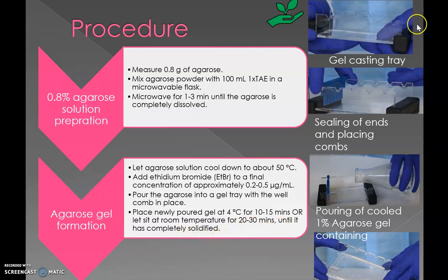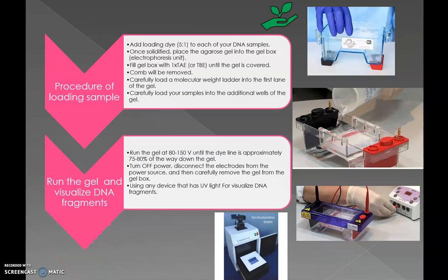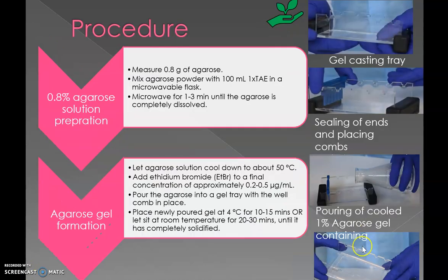Here we can see the gel casting tray. First, we seal its ends, then place the comb, and after that pour the agarose containing ethidium bromide. After 30 minutes, we can see the gel has been set with the wells present in it.